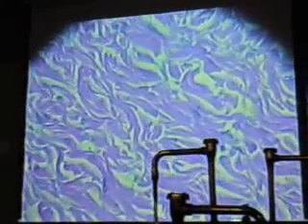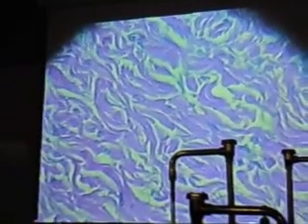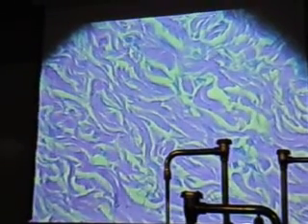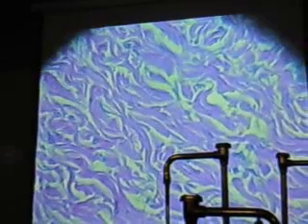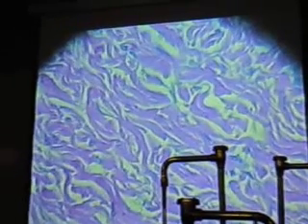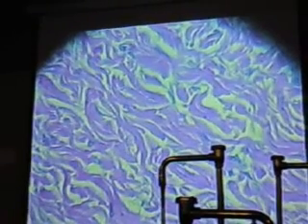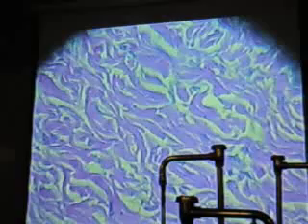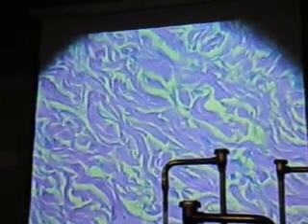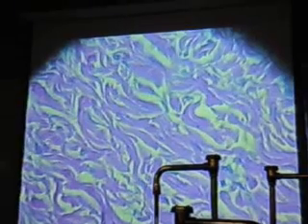Now, we'll switch gears here just a little bit. What layer of the skin are we in here? Dermis. Loose or dense? Dense. Can't see any individual fibers there. Regular or irregular? Irregular, fibers going all over. 2 types of non-living matrix. Collagen and elastin.